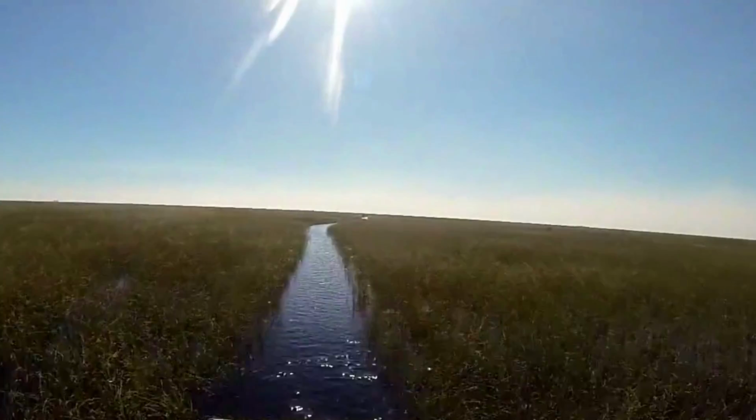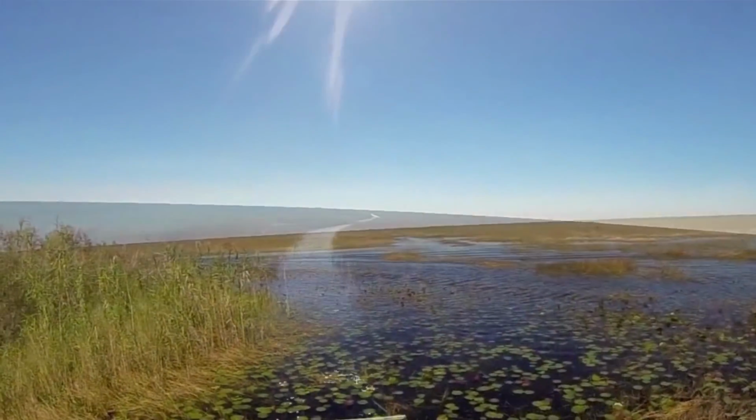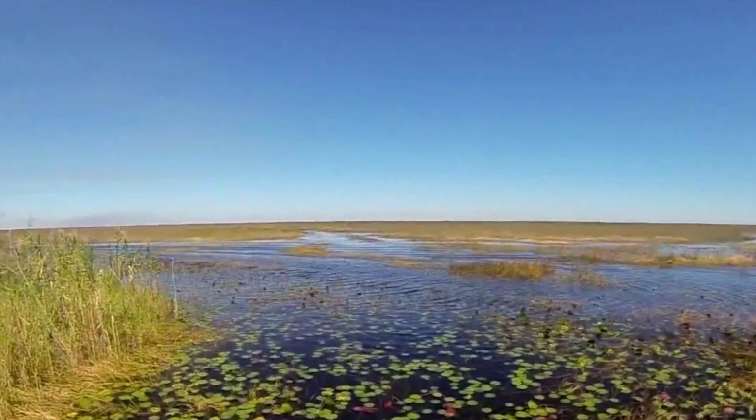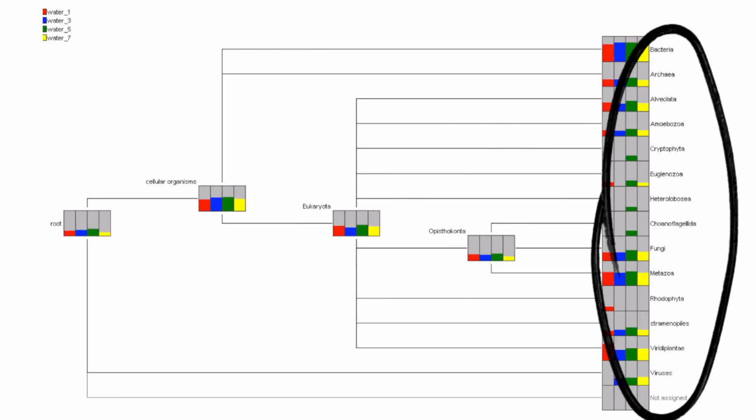We had a project where they're looking at the Florida Everglades water sample, trying to identify endangered and invasive species in the water sample. And we ran some DNA samples on the next-gen sequencing chip, the semiconductor-based chip, and sent the results over to the Cray. We made about a 24-hour run on the Cray because it requires some high-performance computing to actually do the data analysis. And the output looks something like this, where they have a list of species in the water sample.